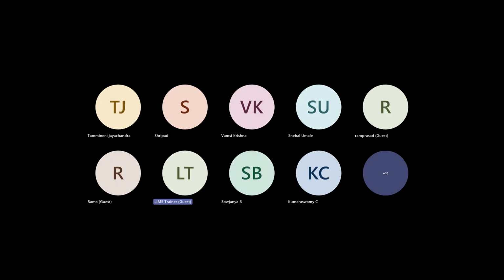If you come to advanced level, there is LIMS basic code. Now, LIMS basic code means that for LabWare, they have one particular coding language. That is another topic and another course, to be very honest. But yes, if time permits, I'll try to cover something here. Even in the IT field, there are various fields.